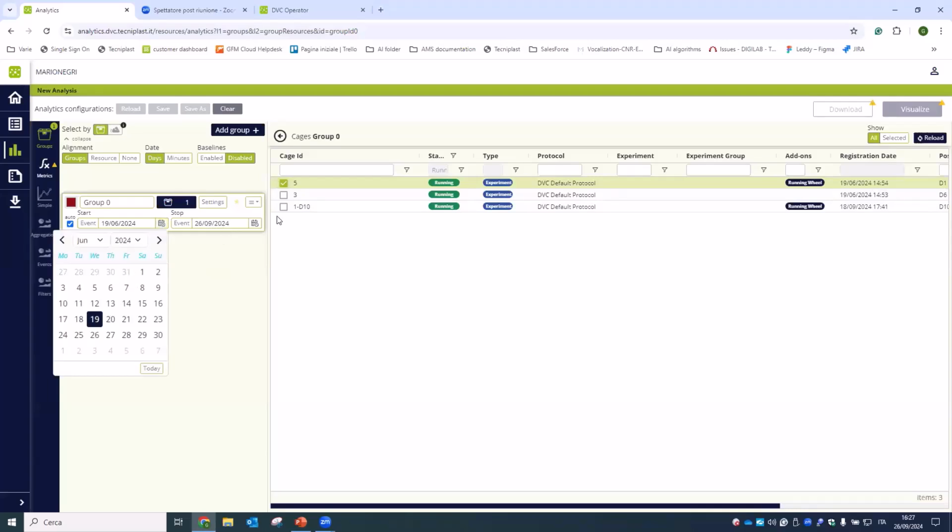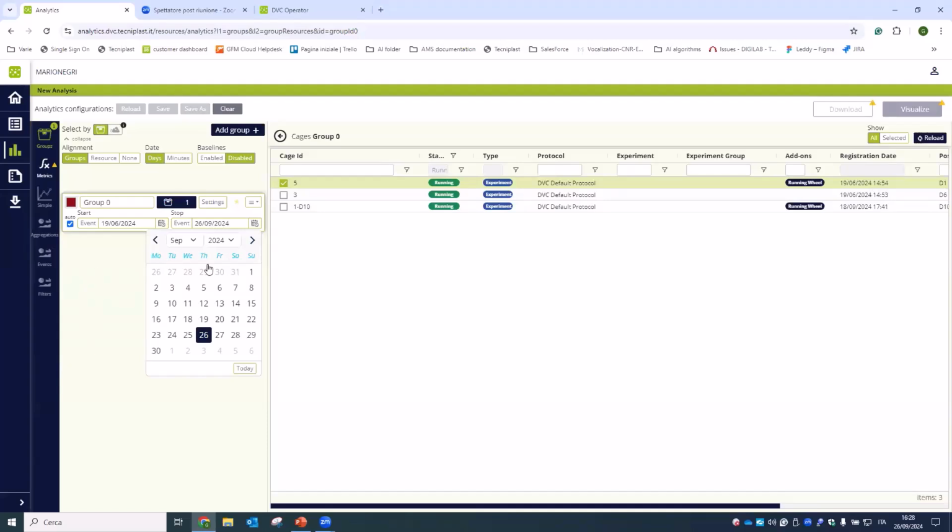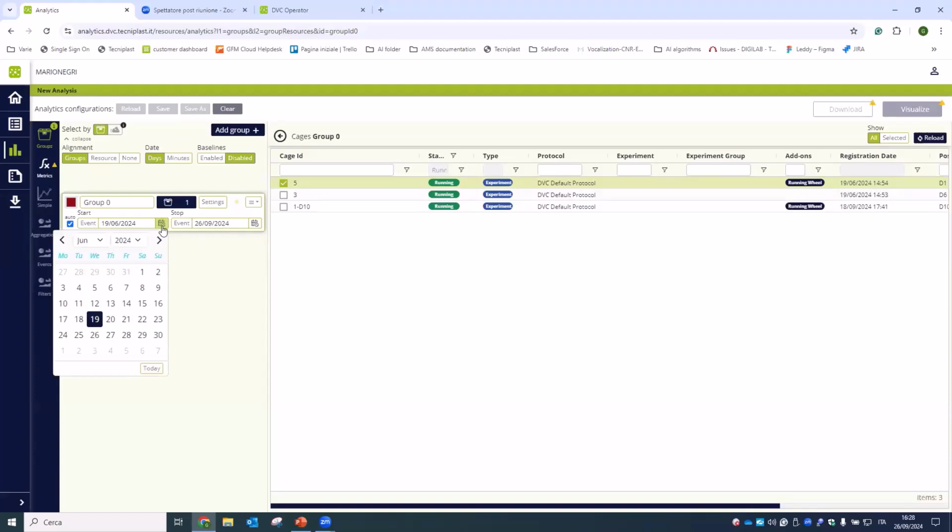These are calendars. You can filter the analysis better depending on the period of analysis you want to perform. I know, for instance, that this case, if I'm not wrong, let's have a look at the end, should have been used for a while, then stopped, and then again last week or so. So I've just modified the starting point of the analysis to the 18th of September. Now you see there are still some triangles.